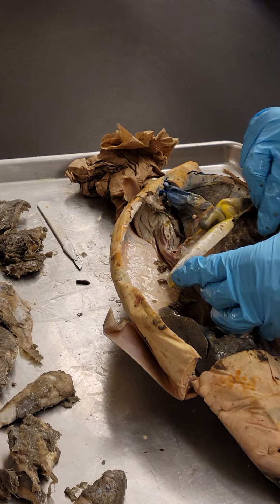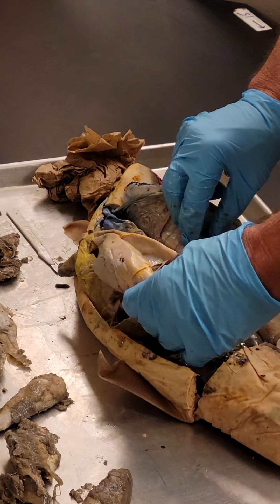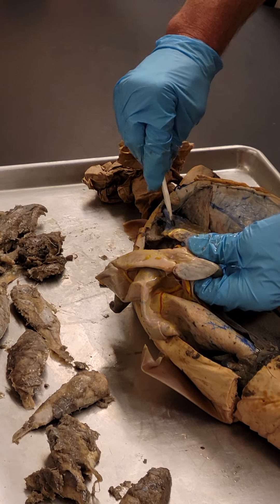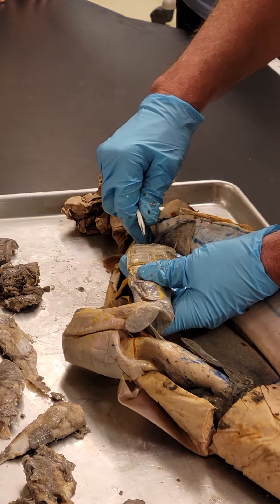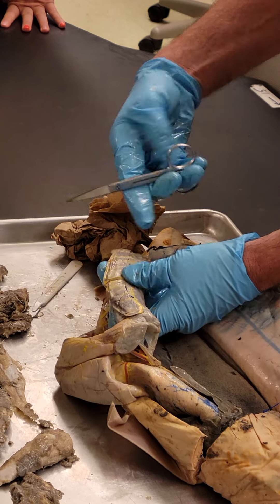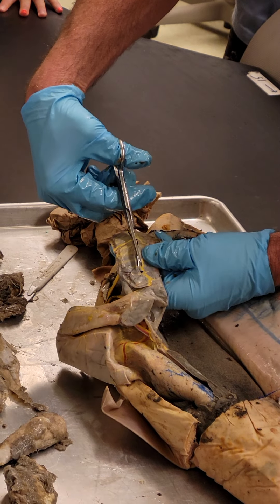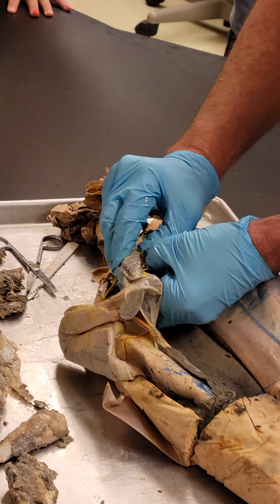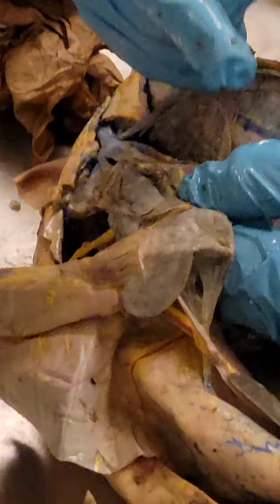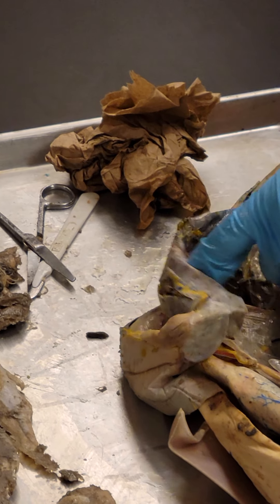So that's the stomach. The pyloric valve holds food in there while the acids break it down, then allows it to transfer slowly. Let's go ahead and open the intestine so you can see the spiral valve. In the intestine, you can see it doesn't have just a straight shot through — there's a membrane that goes through it. It acts like a corkscrew, where the food has to spiral through and get absorbed along the way. The rectal gland is just for osmoregulation — it's not a digestive gland.